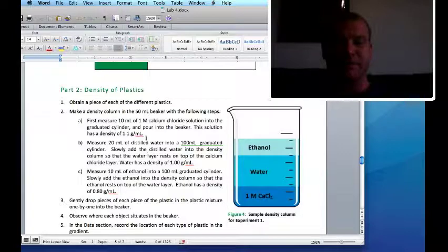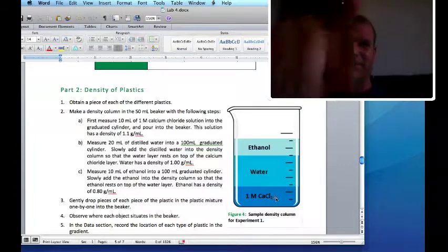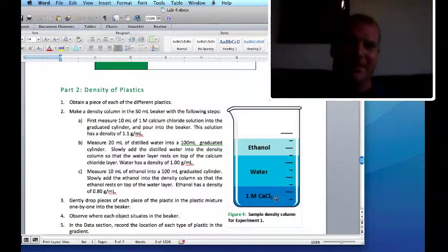Now, so put 10 milliliters of 1 molar calcium chloride on the bottom. This stuff is really safe. You probably can drink it if you want to. I'm not telling you to drink it. It's a bad idea. You never drink anything that comes in your lab kit. Remember that. Safety. But this stuff's pretty darn safe.